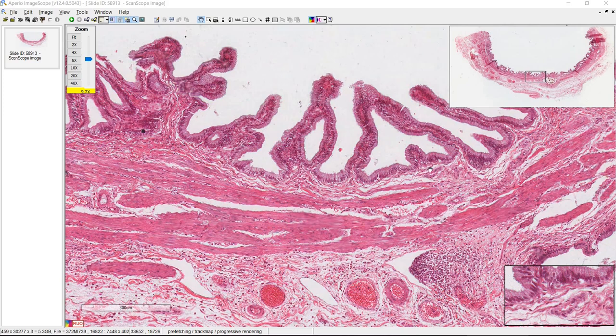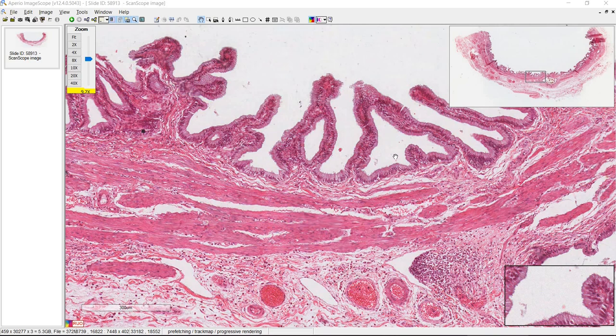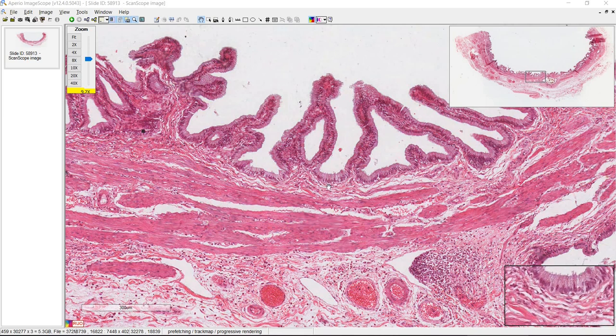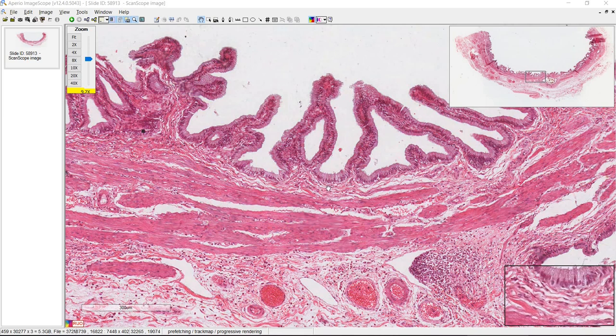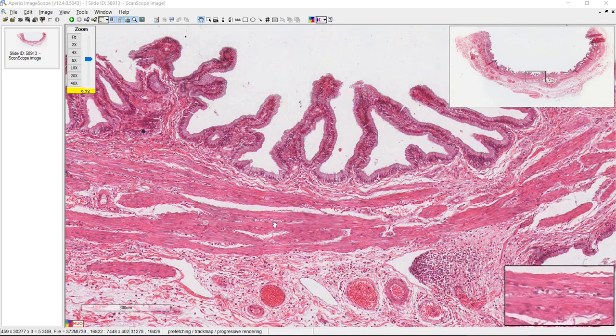Let's talk about the gallbladder. At first glance, this looks kind of similar to other organs in the GI tract, but there are some differences. There is no muscularis mucosal layer here, and there's no submucosa. There's a mucosal layer made of the epithelium and the lamina propria, and after that it goes right to the muscularis externa.